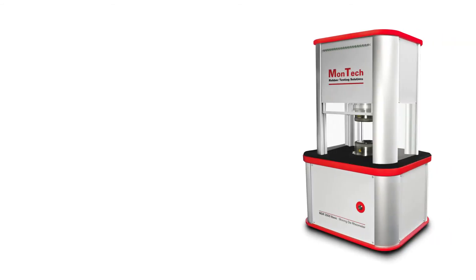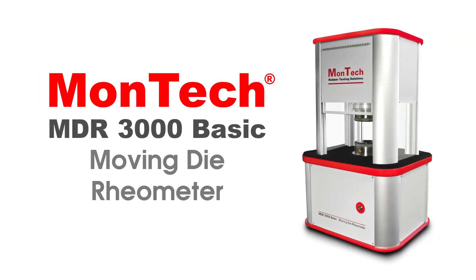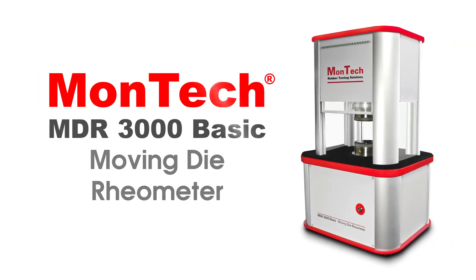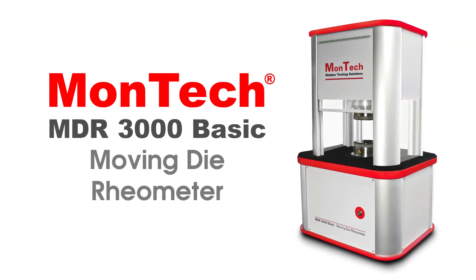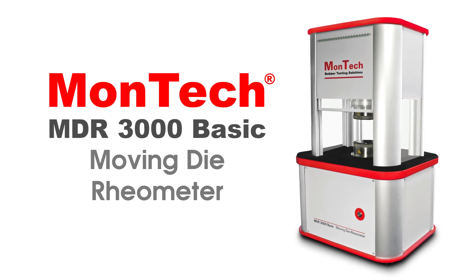MonTech's MDR3000 Basic gives reliable and accurate results for essential tests in rubber and polymer production. Contact us or visit our website to learn more about MonTech's MDR3000 Basic.